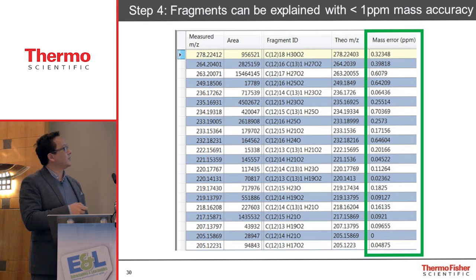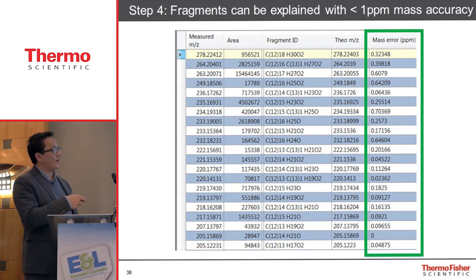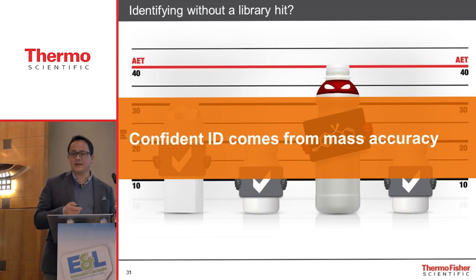And again, what we're able to do with MS that can be automated is you could take that molecular ion, you can fragment it up again if you want for absolute confidence in that. So here's a fragment ion spectra of that molecular ion with the results showing all of the mass errors significantly below 1 ppm.